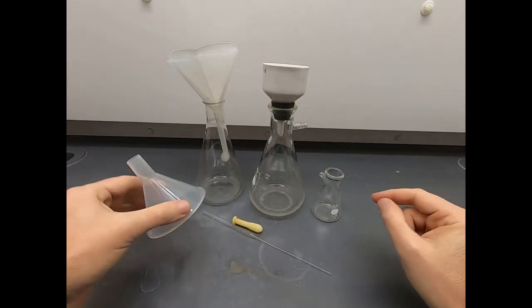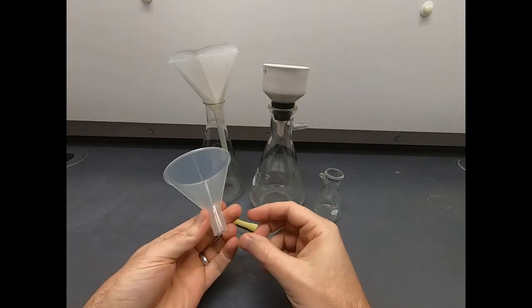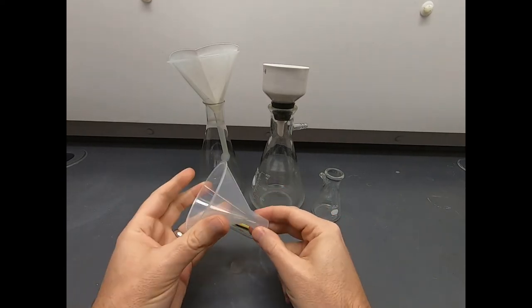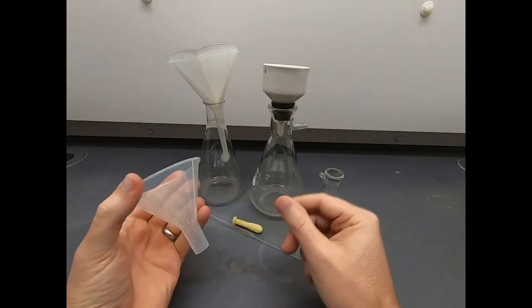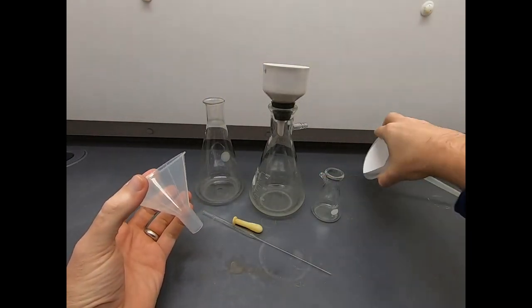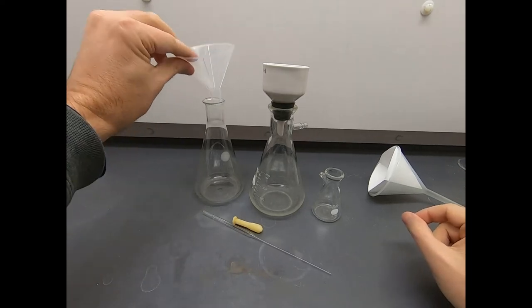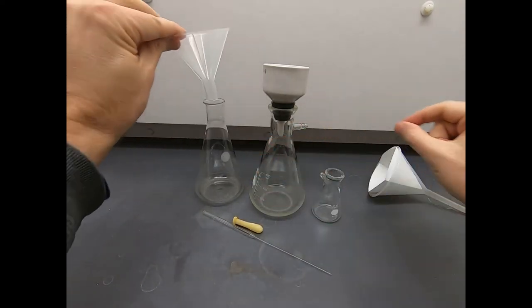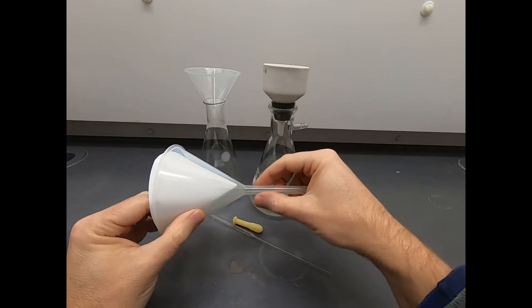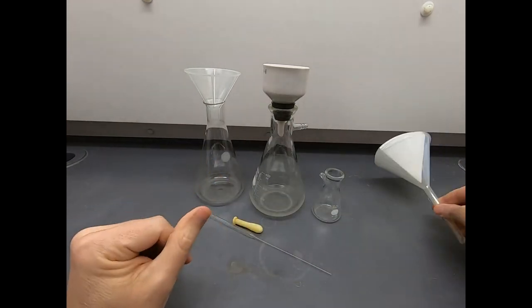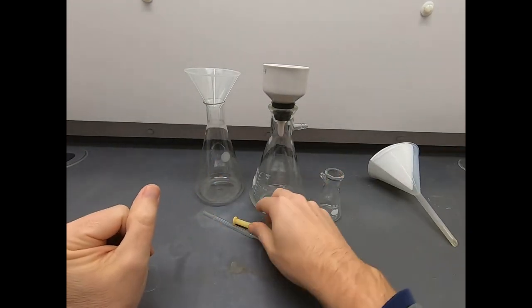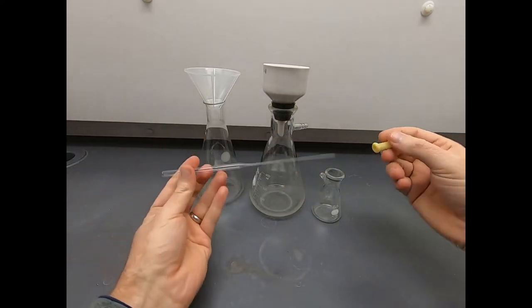I have a couple other things in the hood. One is this funnel. Note this is a short stem funnel. This is great for transferring solids. If you want to transfer some solids into a flask, you can use this kind of funnel. Notice it has a short wide stem that's good for solids. The longer stem is for liquids.